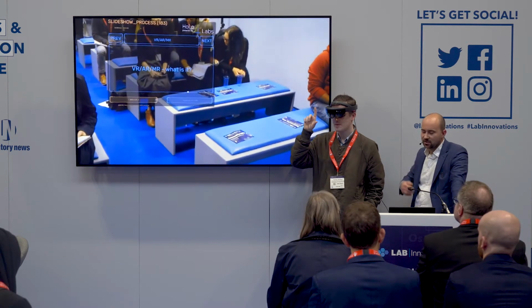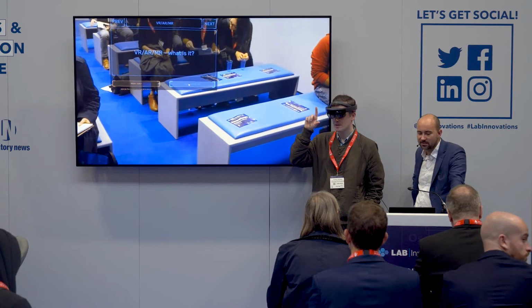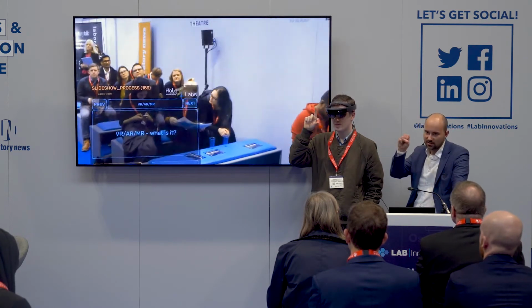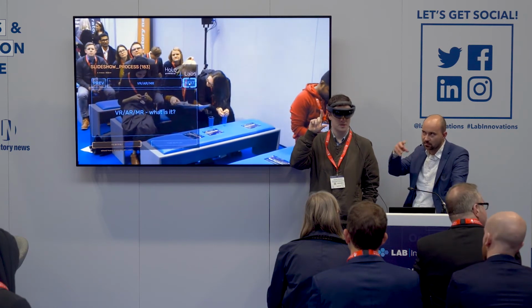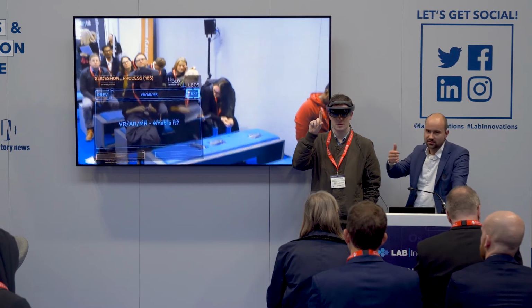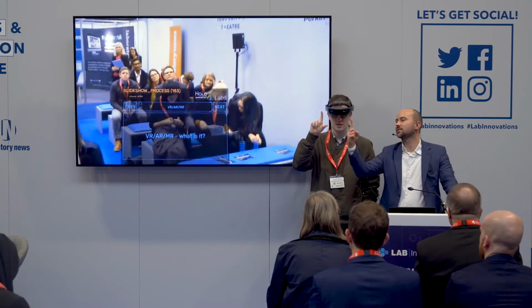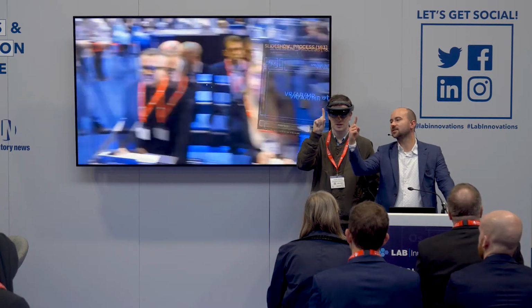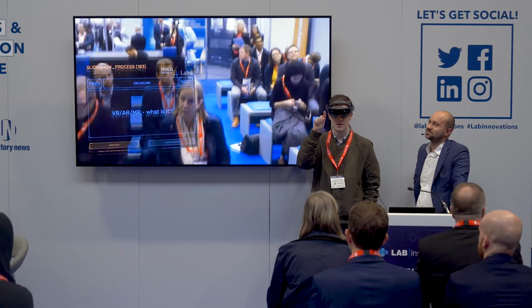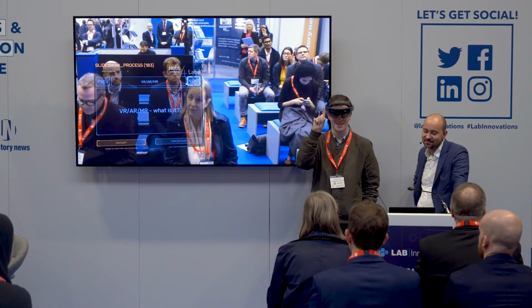We have implemented it in our software in this way, so you can put the image, and it will be stable in place, or you can go with the image with yourself. So there are 2 ways. You are clicking with your straight finger and moving in this place. Yes, but it needs a little bit of training.